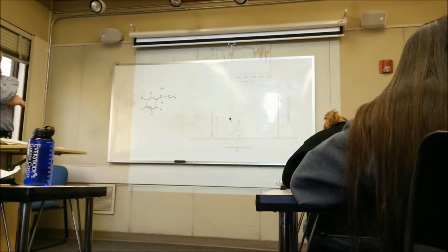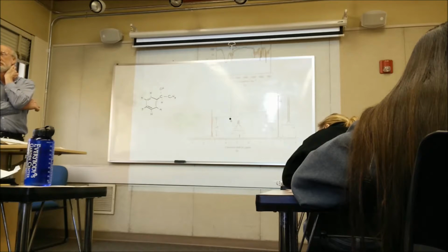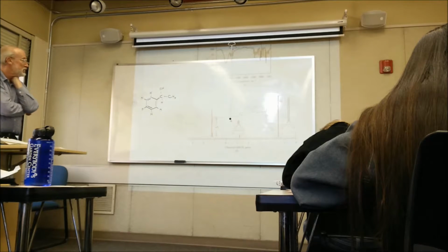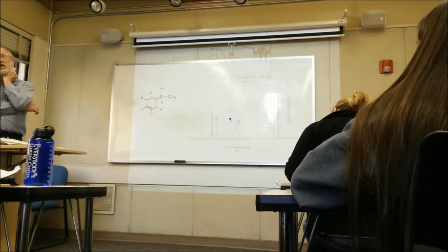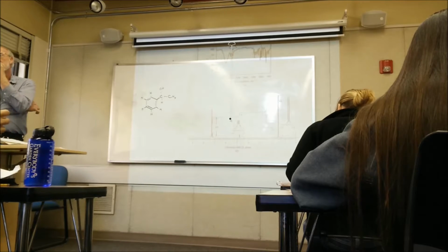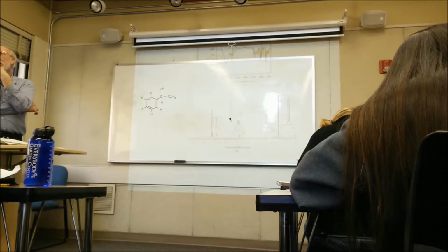So wait, then the OH is the one that's like... Yes. Okay, so we're going by that. You said this above 4, and then... Yep. But that's not consistent with the splitting. And I pay less attention to the chemical shifts than the splitting and the integration. The splitting and the integration are exact, the chemical shifts are not. But they seem pretty easy to just... Yeah, especially for alcohols.